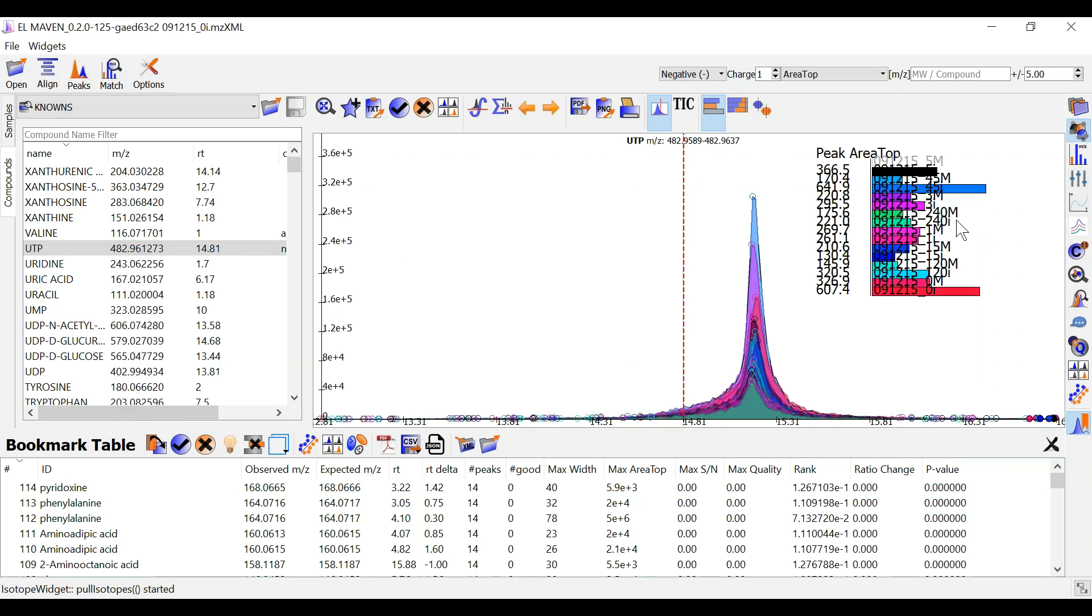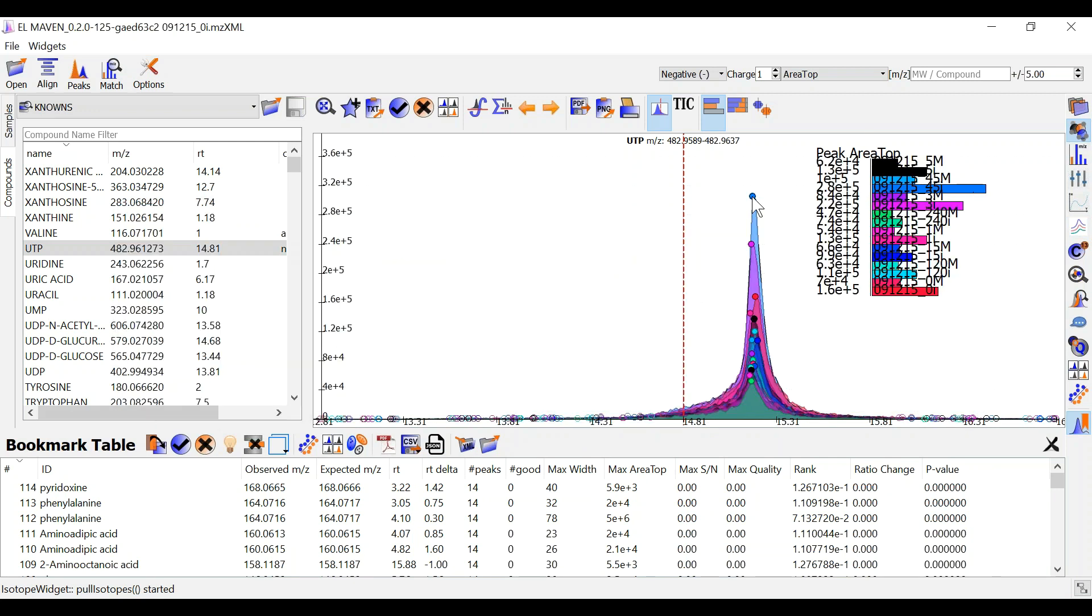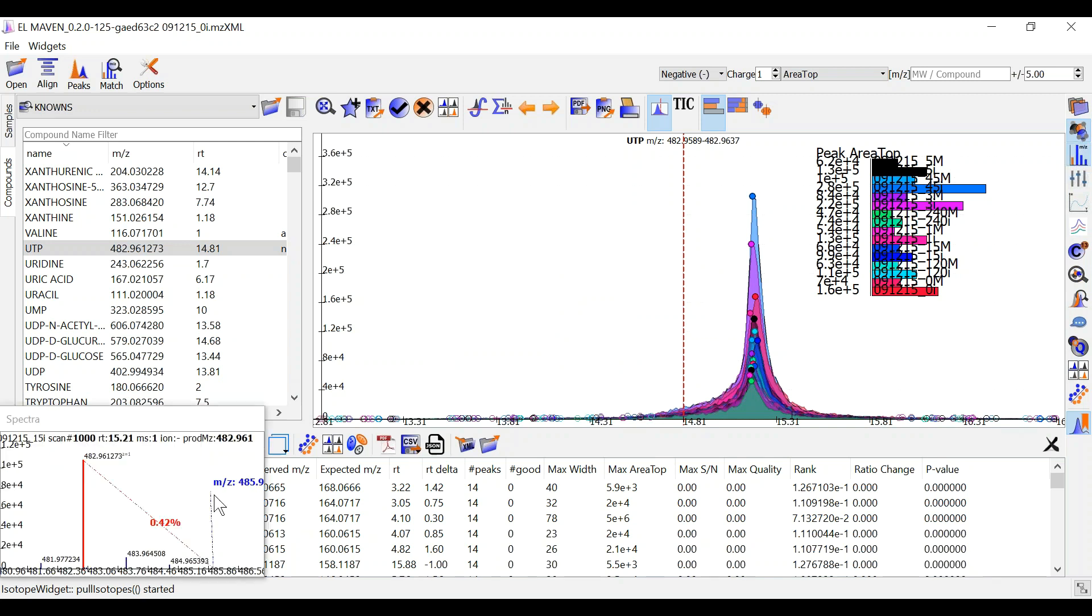You can also see the mass spectra of each of the groups by clicking on show spectra widget over here. The spectra displays each peak its mass and its intensity for a particular scan.